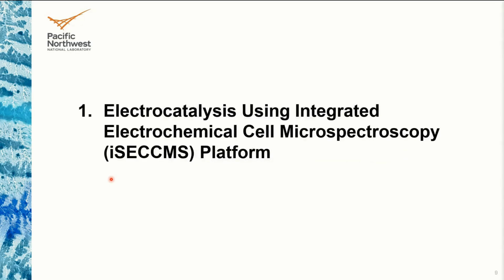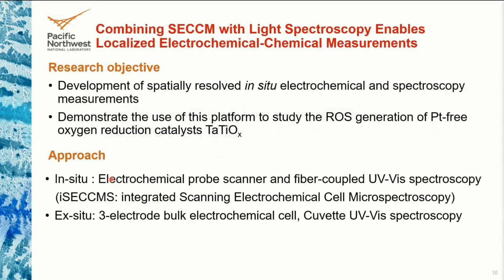In electrocatalysis, in our lab, we combine the SECCM with several microspectroscopy tools and call it an SECCM-spectroscopy platform, which enables the localized mapping of electrochemical activity in addition to the spectroscopy as well. The main research objective is to use this SECCM platform to study the reactive oxygen species generated in oxygen reduction catalysis. In our case, we demonstrated this platform for monitoring the ORR activity, or the generation of reactive oxygen species, at tantalum titanium oxide.